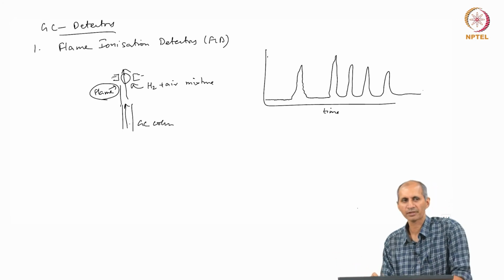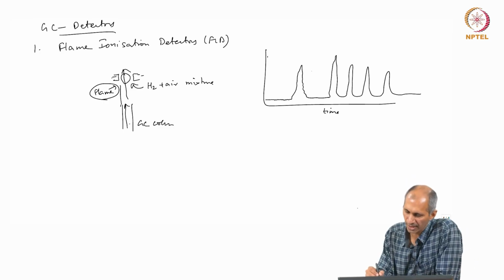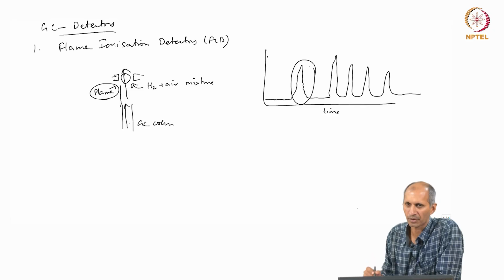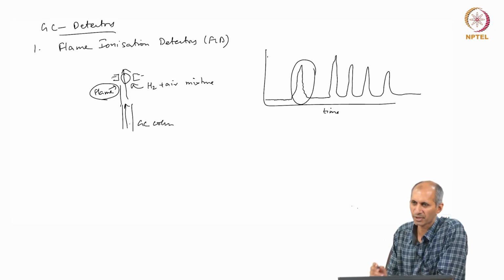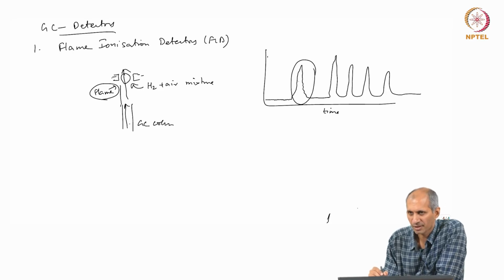Because it's chromatography, your hope is that the peak you are looking at is only one compound, not a mixture of compounds. So, the resolution, the separation, you need to be sure that this is separated. That is a big challenge in the analysis of mixtures.